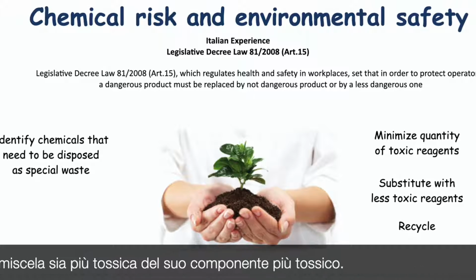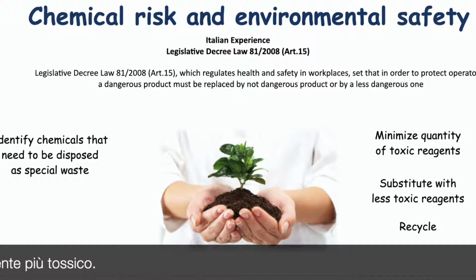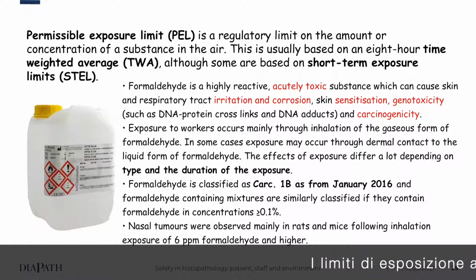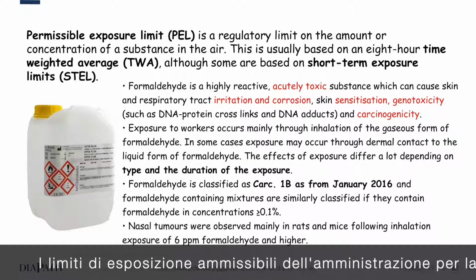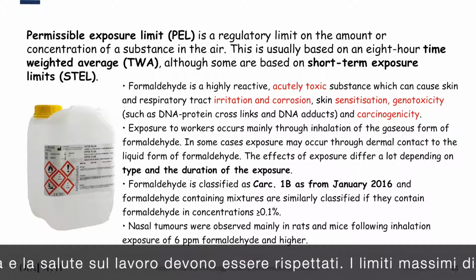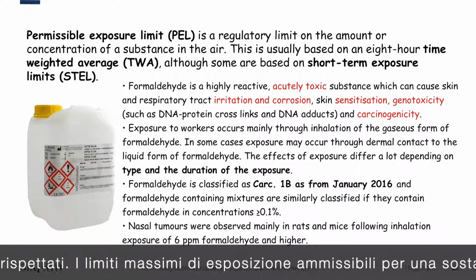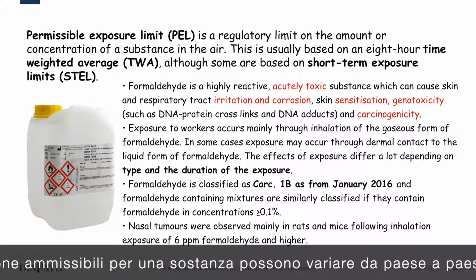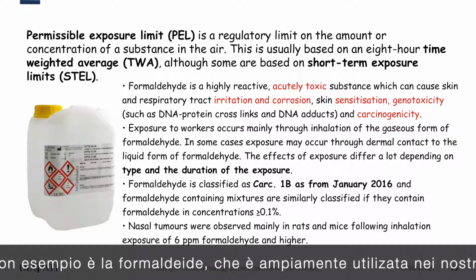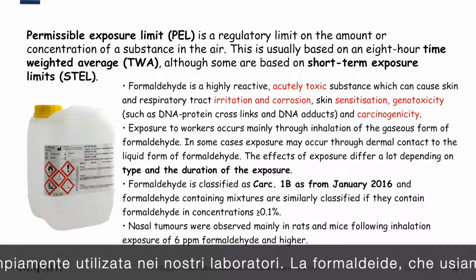Unless known otherwise, assume that any mixture would be more toxic than its most toxic component. The permissible exposure limits of the Occupational Safety and Health Administration should be observed. The maximum permissible exposure limits for a substance can vary between countries. A good example is formaldehyde, which is widely used in our laboratories.